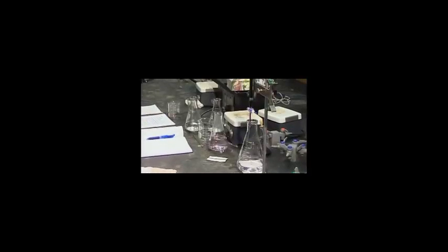And so it's a very pale pink. So you know that your titration was correct. So just to recap, we took our leftover 1 molar sulfuric acid and titrated it with 1 drop of our potassium permanganate in the burette, and just observed that it did in fact change color, so we can correct our endpoint to adjust for that.